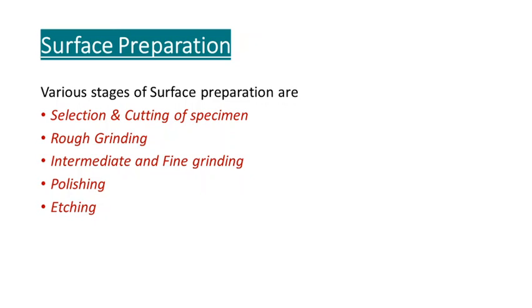But before moving into the microscopic techniques, we have to prepare the samples. In the case of X-ray diffraction, we need not make any preparation for the sample. We only have to make a suitable sample which can be mounted on the diffractometer. But that is not the case for microscopic studies. Depending upon the type of microscope we are using, we have to do sample preparation, or cut the sample to the required size.